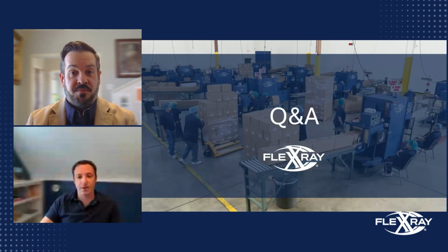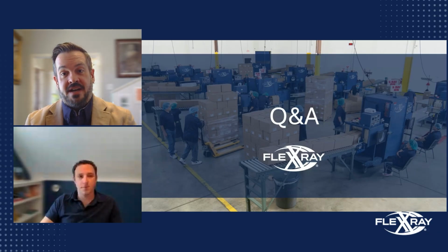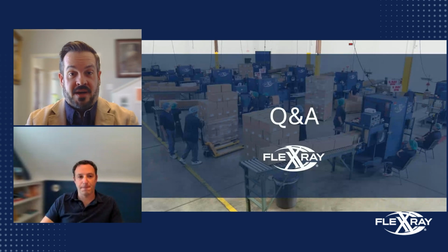But if you had a bespoke product or essentially a very expensive or high valued product and you had the space, you could use a CT inside your own production environment. The cost, the size, the capabilities of it, it's best, in our opinion, serviced as an offline instrument. And that's how we maximize the opportunity.